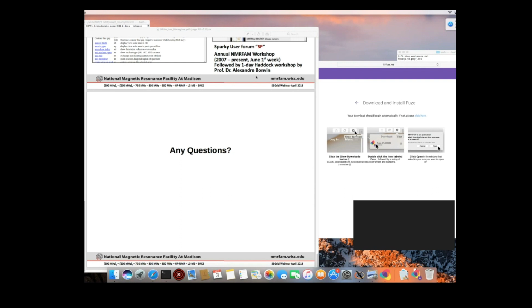Well, the iPine only considers the peak list, not the spectrum itself. So providing the punctual peak list is pretty important. Last year I published a paper about the Pine-Sparky 2, and I used the AESCP2 protein that has a little bit of conformational heterogeneity.